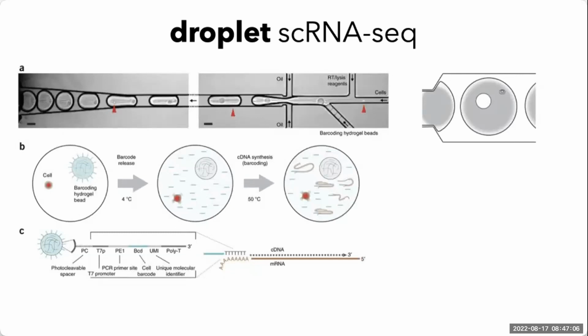So these droplet-based platforms typically have the highest throughput compared to the other two methods, and since the library preparation is carried out at the nanoliter level, reagent costs are extremely low, and that compensates for the system itself, which requires more financial investment.